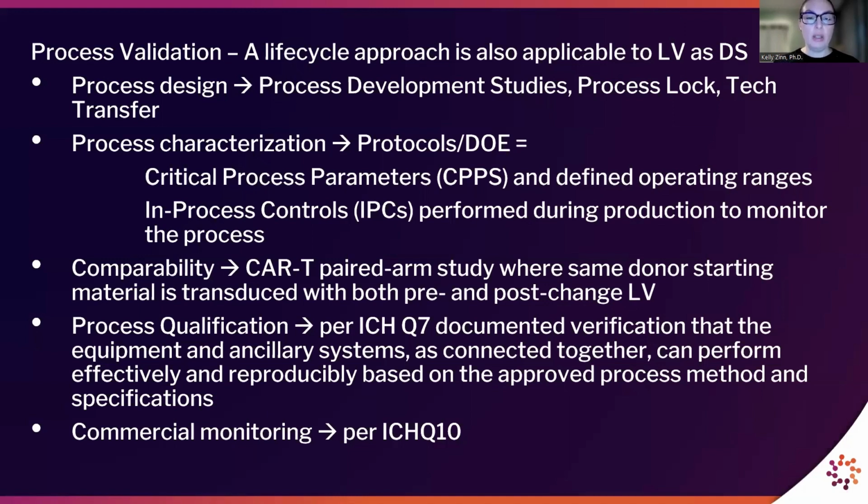So you've seen a theme in this presentation that the lentiviral vector drug substance development and characterization has many parallels to CAR-T product. And I'll also point out here that even when changes are made to the lentiviral vector, the FDA has recommended comparability studies be carried out in the CAR-T product with a paired arm study where same donor starting material is transduced with both pre and post-change lentiviral vector.